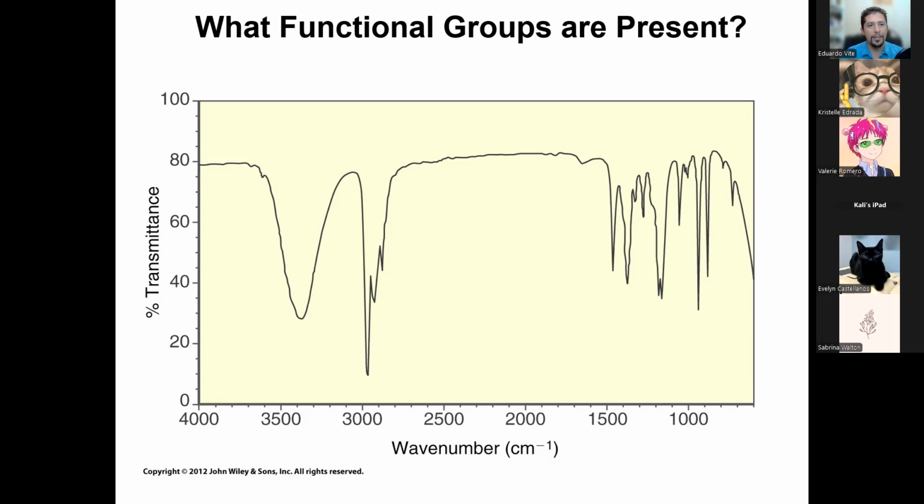Alcohol? Amine? Okay. Well, if it were an amine, would the signal be strong or weak? And does that look like a weak signal to you? It's at 25%. Exactly. So since it is not a weak signal, it is not an amine. So it must be, Evelyn said it, an alcohol. So this is a hydroxyl, OH.